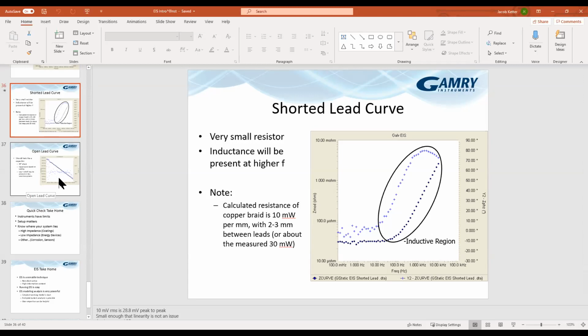In practice, however, potentiostatic measurements tend to be, quote unquote, safer. That is to say, you don't worry about over-polarizing the cell. Applying a potential that gives you too much current back is not doing damage, because in that case you're dealing with a low impedance cell and it can handle the high current. However, applying a current that gives you too much voltage back does two things.